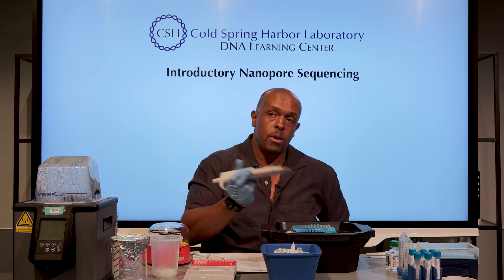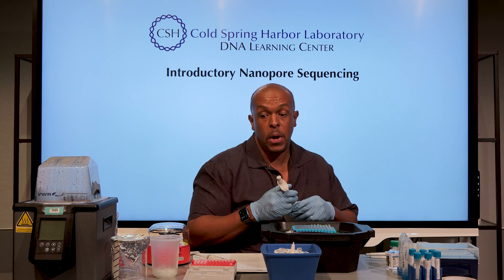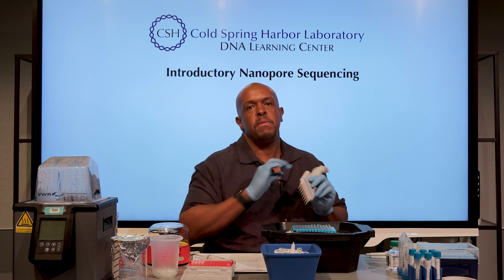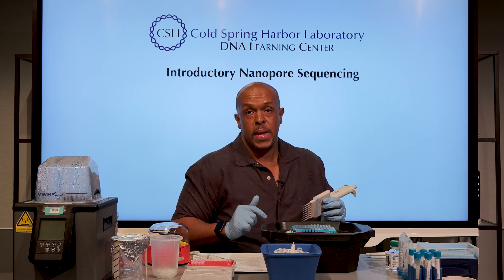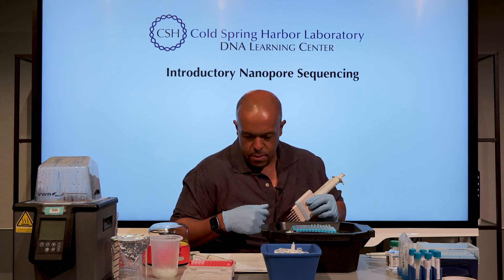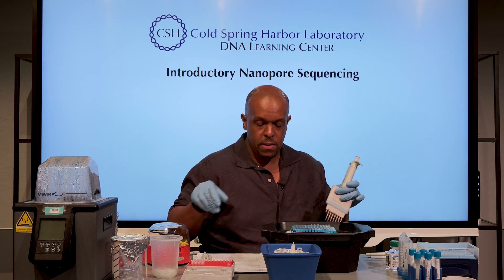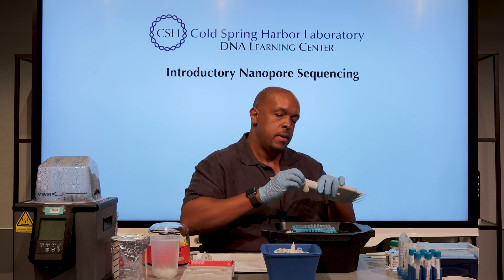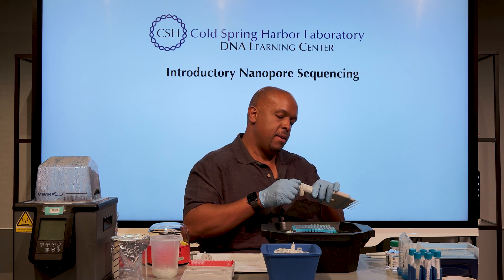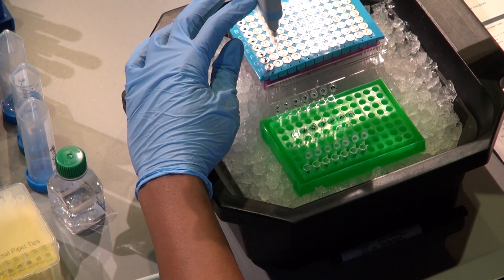The last thing to do — and this is a pretty quick step — is to go ahead and get your primers. These are the primers for the 16S gene, but every single tube here is barcoded, so the resulting PCR product is going to be unique to that particular sample so that we can decode it later. I've gotten the DNA in there, I've gotten the 2x TAQ, and it's going to be 10 microliters of primers.